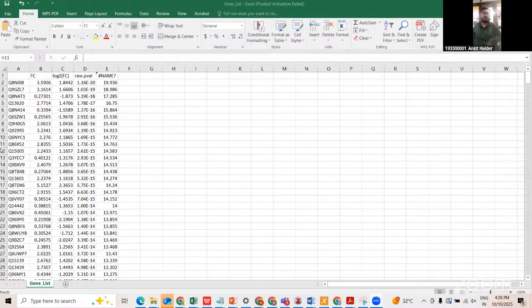I am hopeful that you all remember that you will get this kind of matrix where there will be protein IDs, fold change, log2 fold change, p-values. So you understand which proteins are exactly your significant list of proteins, but then you need to make sense of it: what can we understand biologically, what mechanism might have undergone, that these proteins are coming as dysregulated, or these sets of proteins are coming as differentially expressed in the cohorts.